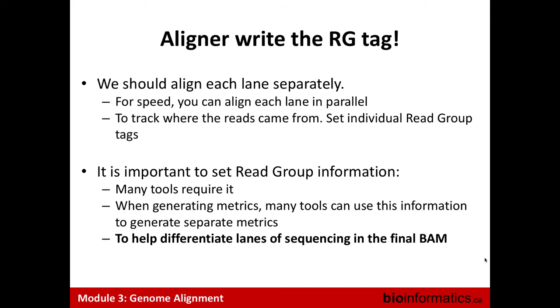So that only pertains to sequencers that have multiple lanes, right? Like in MiSeq, that wouldn't pertain. Yes, each time you sequence on multiple lanes, or even on a MiSeq, if you do two or three runs for the same sample, each run gives you one output, you align it, and you put a specific read tag. But it's usually used more by lanes, because on MiSeq you usually don't do so many redo or complementary runs.